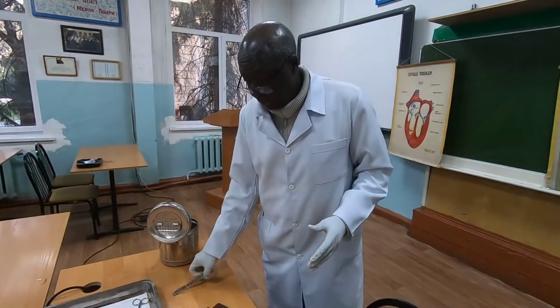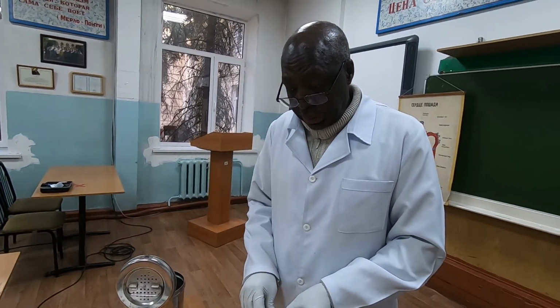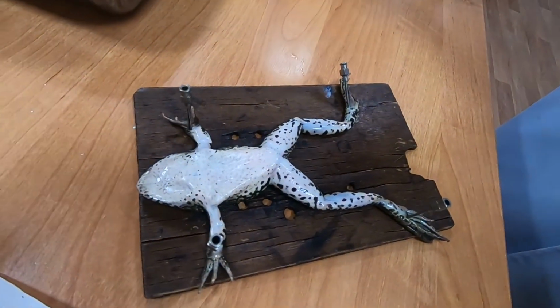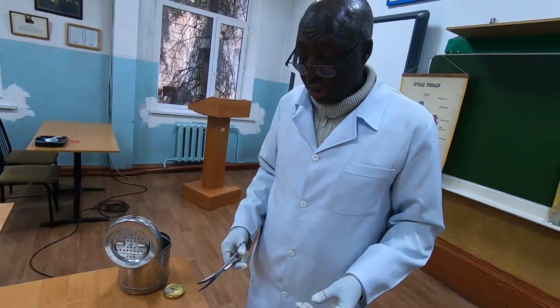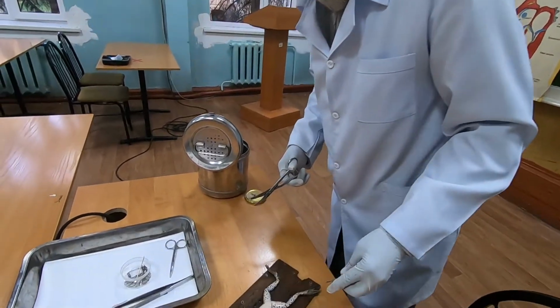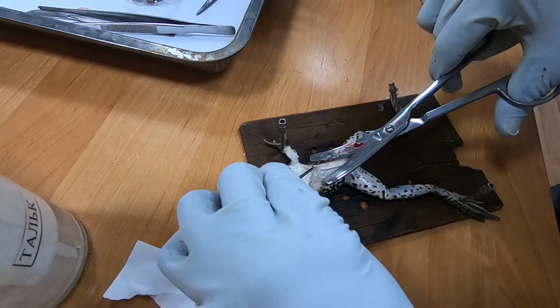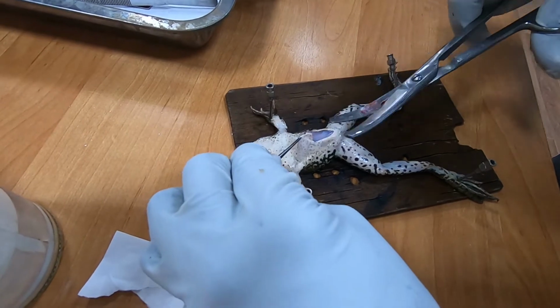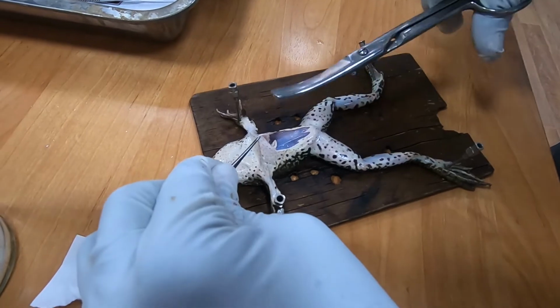Dear students, now we have fixed our frog. We are ready to open the heart, so that we can carry out our work. So this is how we do it, okay? This is the process of opening the heart.